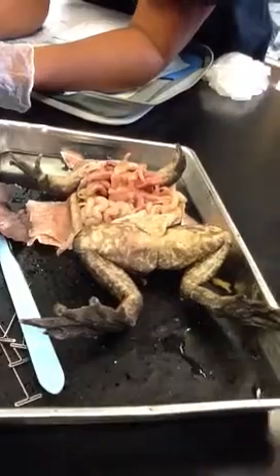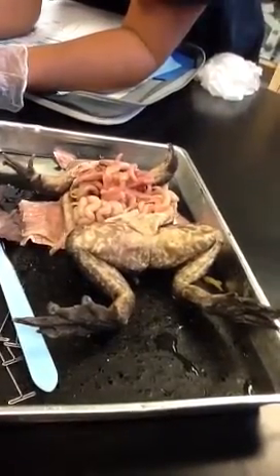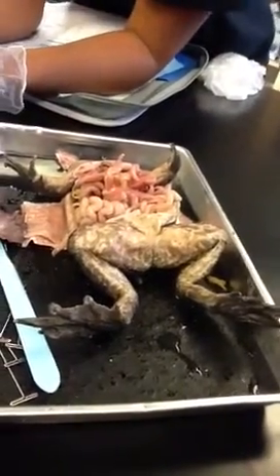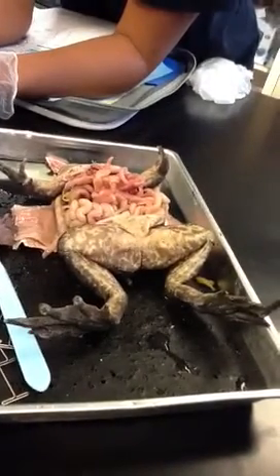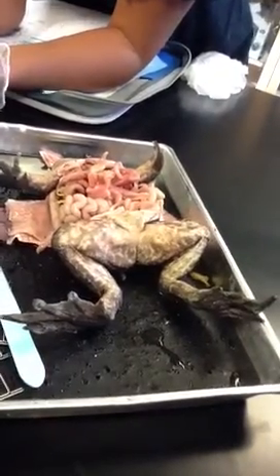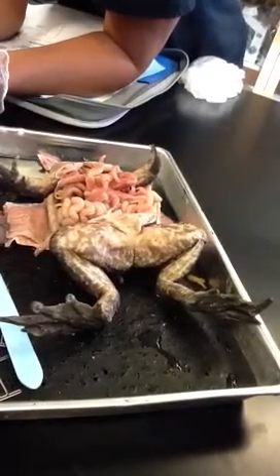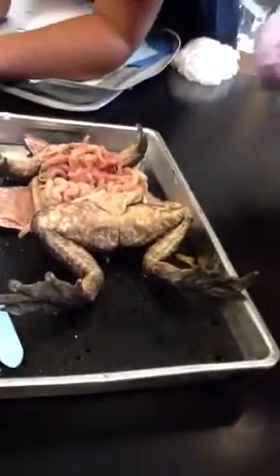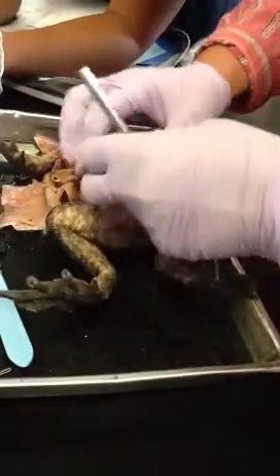All right, you guys are going to keep your frog because you're going to use this on the final practical, and that's quite a ways away. So before you leave, and when you're done with the frog, you're going to put it in damp paper towel, put it in a black plastic bag, and then find the bucket with my name on it, and you're going to put that plastic bag into the bucket with your frog. And then we have some tape around here up at my desk that you can use to label your frog. So you can look at it from now until the practical.